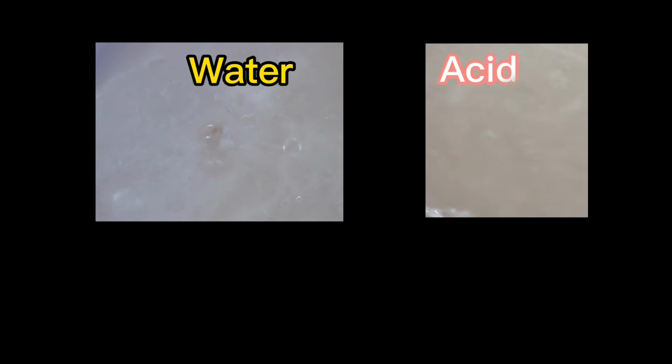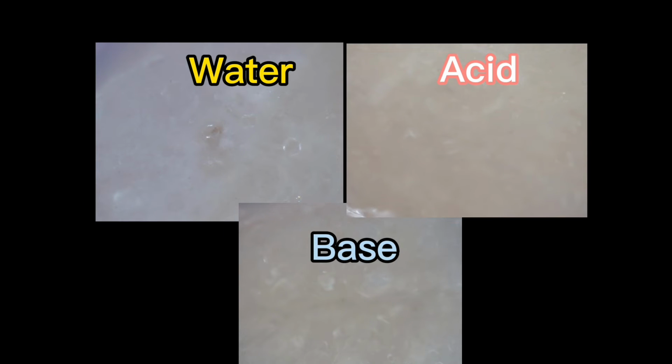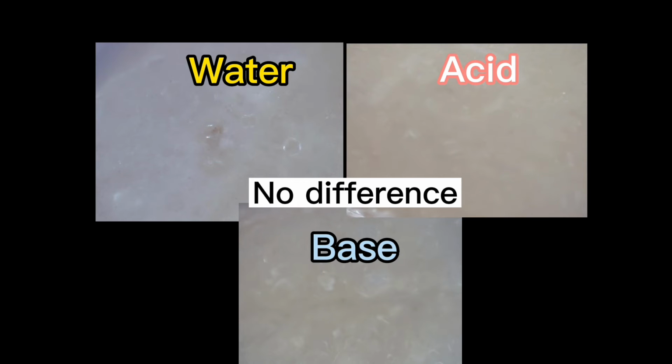In addition to observing the solution, we also attempted to observe the surface of the fries, but there was not much obvious difference between the fries in acid, base, and water solution.